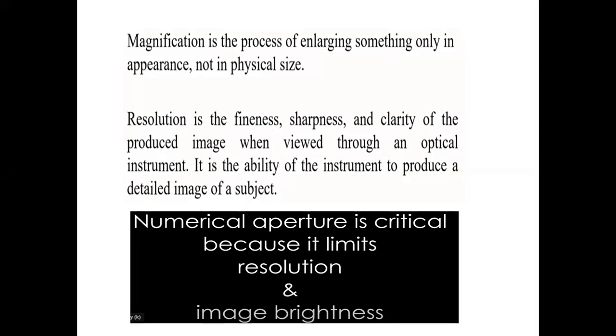In these few sections, we'll be reading about the microscopes, that is, the different types of microscope. Before I go deep into the chapters, I wanted you all to remember three important terms: magnification, resolution, and numerical aperture. Now, why do we use a microscope?